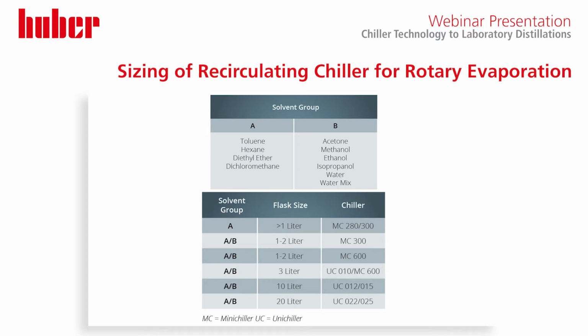These numbers we have also verified in the lab and shown that you can use these solvents and these combinations and ensure that you get high recovery of solvents. We will go through recovery of solvent rates slightly later on in this presentation.